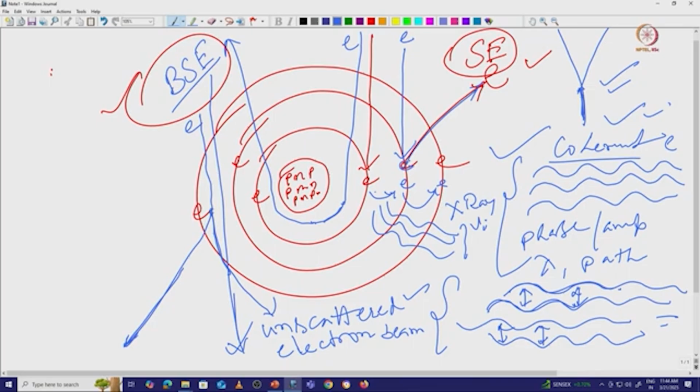So here you can see there is no energy loss, there is no direct electron to electron interaction, it is just a deviation of their path length. So that electron is called scattered electron. So this is called the scattered electron. So this electron is scattered.